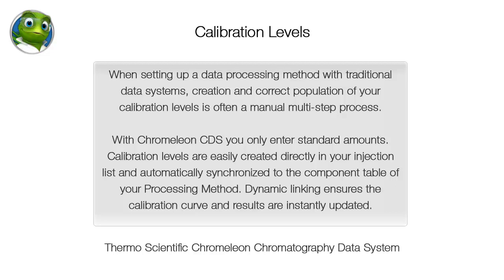When setting up a data processing method with traditional data systems, creation and correct population of your calibration levels is often a manual multi-step process. With Chromelion CDS you only enter standard amounts.